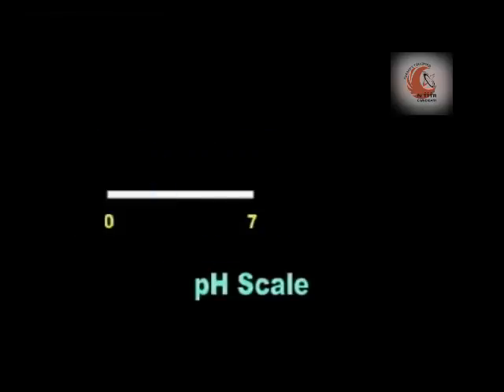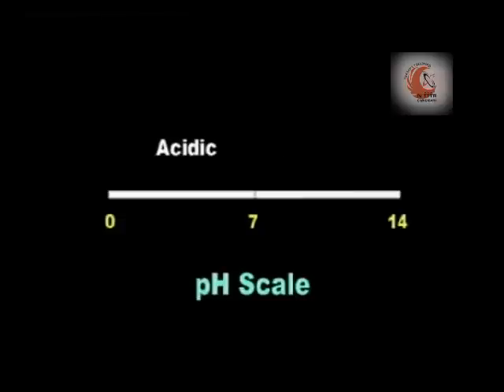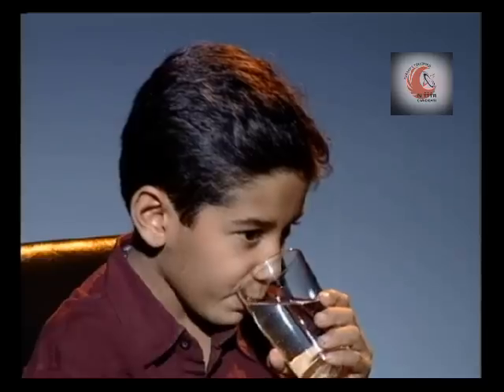pH value is an indirect measure of acidity or alkalinity present in water. Values lesser than 7 indicate the presence of acidity, whereas values higher than 7 indicate the presence of alkalinity in water. The pH value for drinking water usually should lie between 6.5 and 8.5.